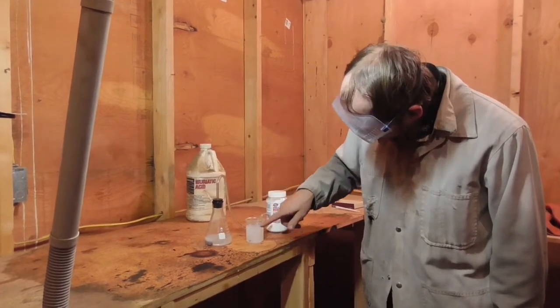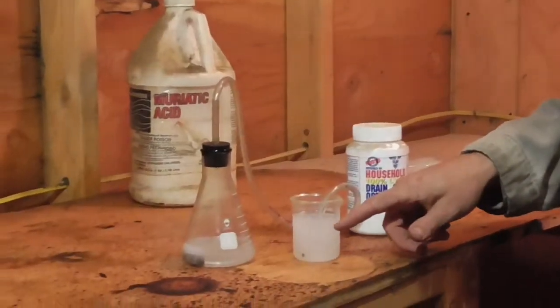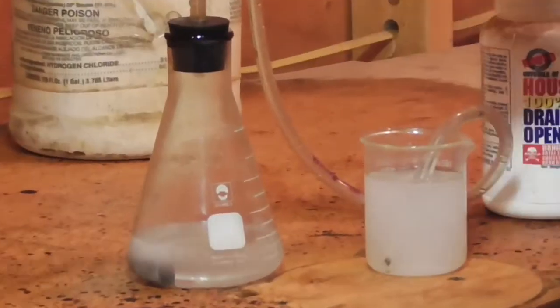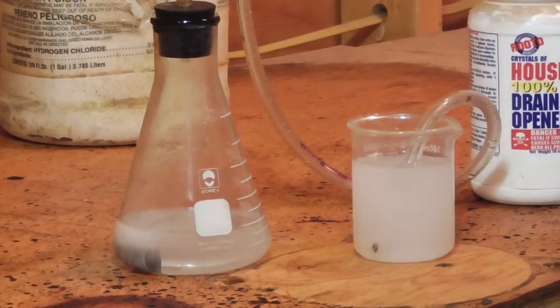If you get a white precipitate forming in the sodium hydroxide solution, that's most likely some aluminum hydroxide from spatters that may get into the tube from, in this case, previous uses.